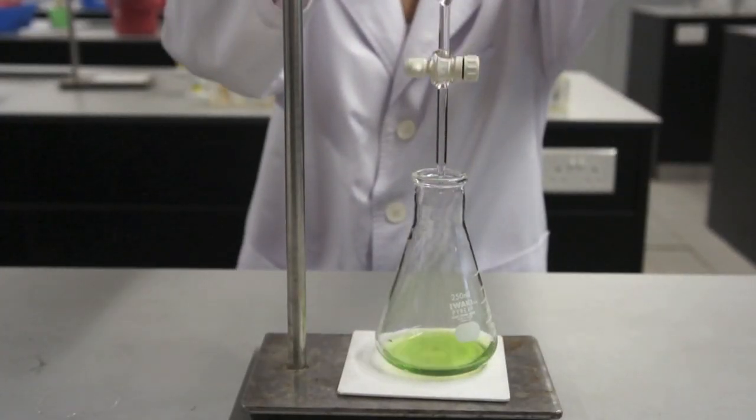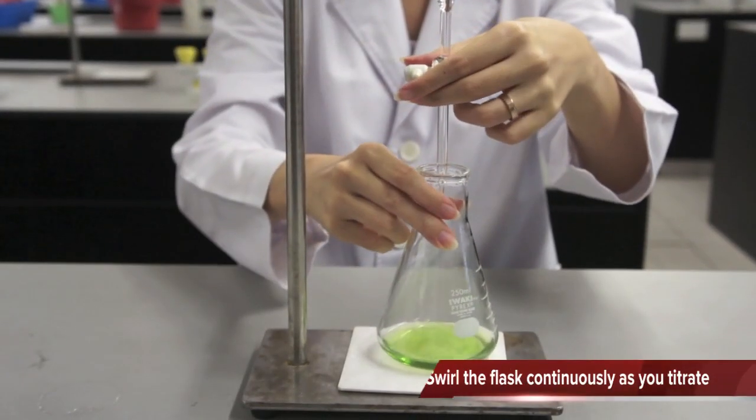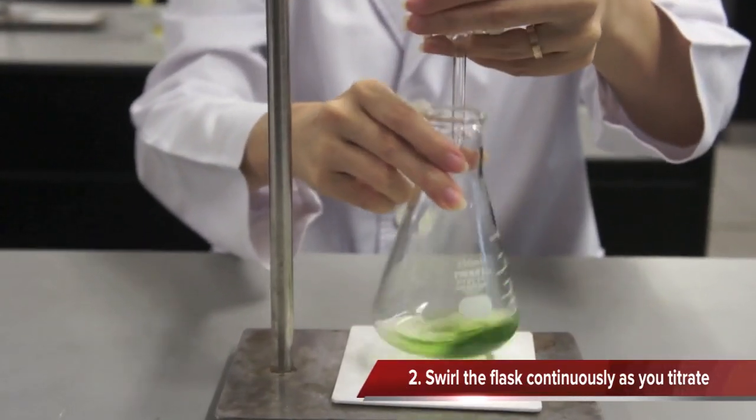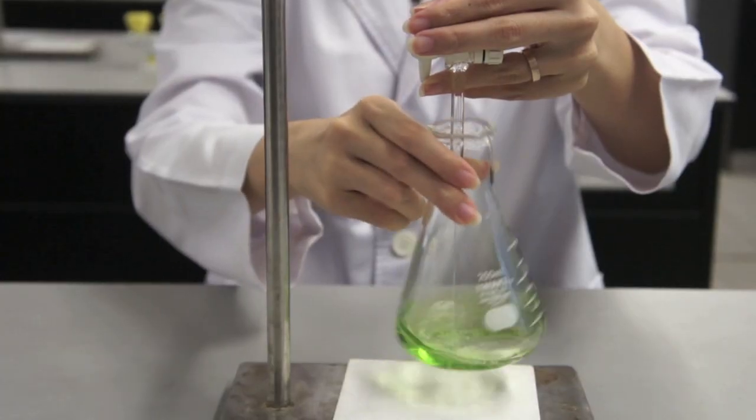Adjust the height of the burette so that the tip is inside the flask. Hold the flask in your dominant hand and use two hands to titrate, adding solution from the burette and swirling the flask simultaneously.